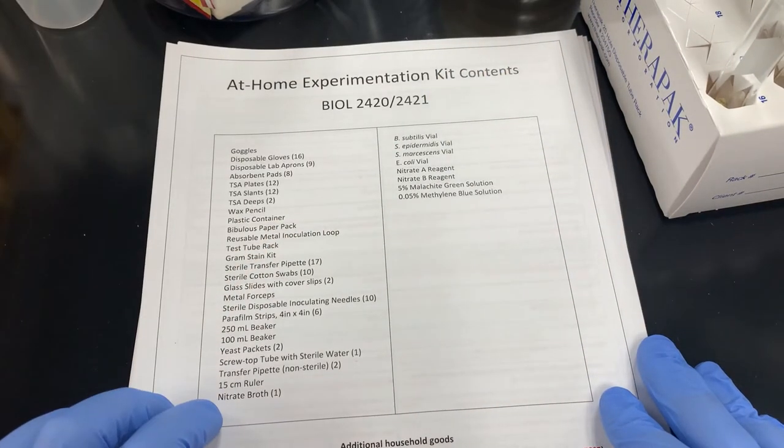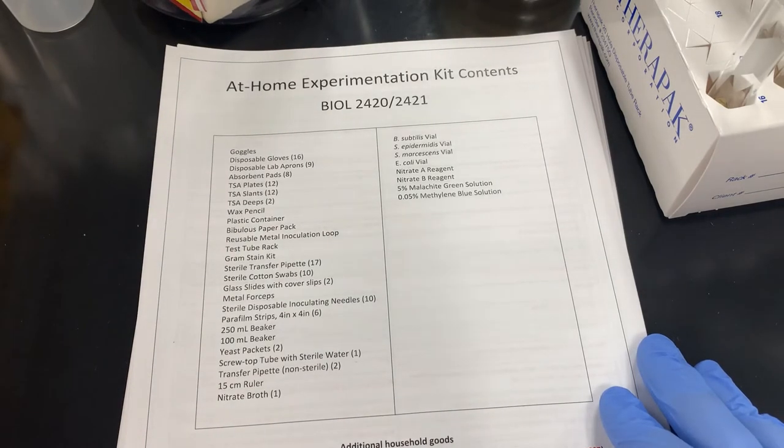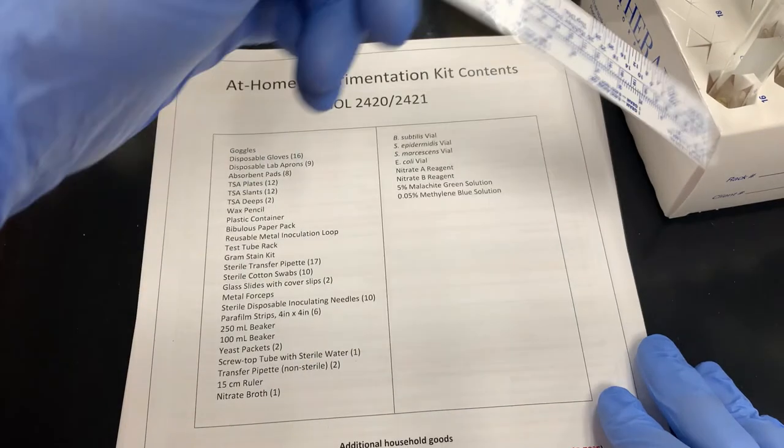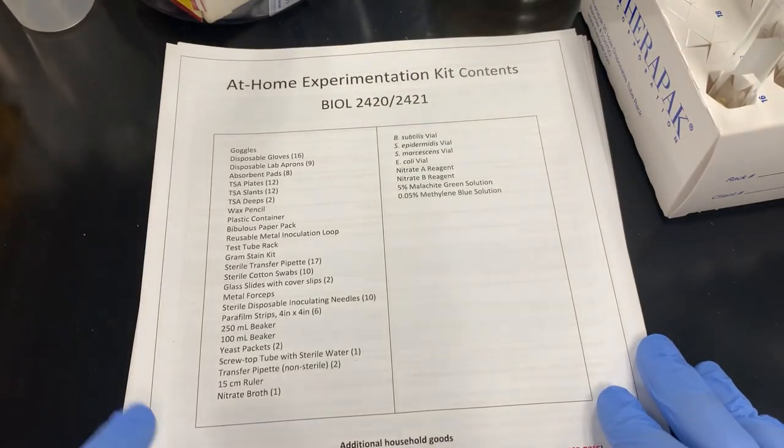It's just water. Now we have the 15 centimeter ruler, and that little guy looks like this. It's a ruler. Ta-da! It says VWR on it. They all look identical. You're gonna use this during the antibiotic lab to measure resistance.